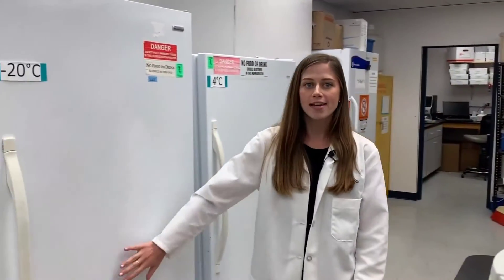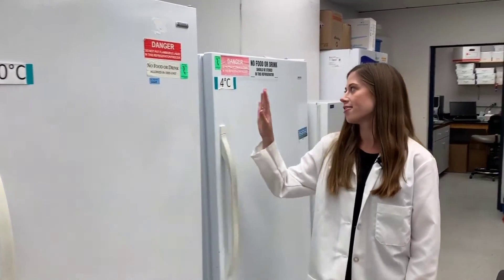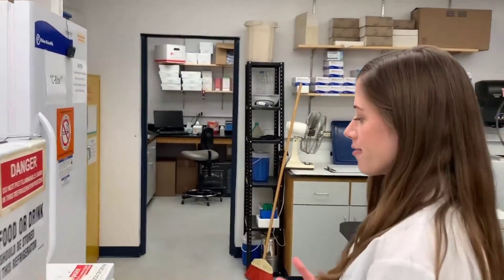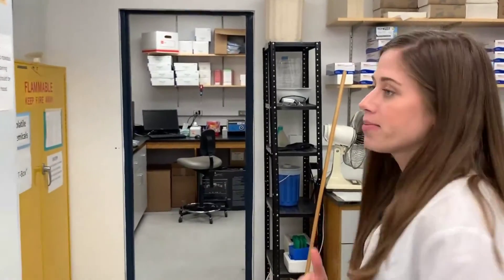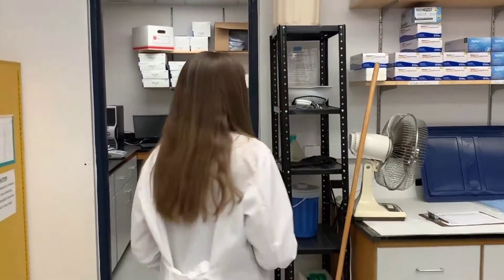Also in our lab, we have a variety of different fridges and freezers at negative 20 degrees, 4 degrees, and in our other room, negative 80 degrees. Different chemicals need to be kept at different temperatures in order to help stop degradation or just to store them and keep them fresh for a certain amount of time.